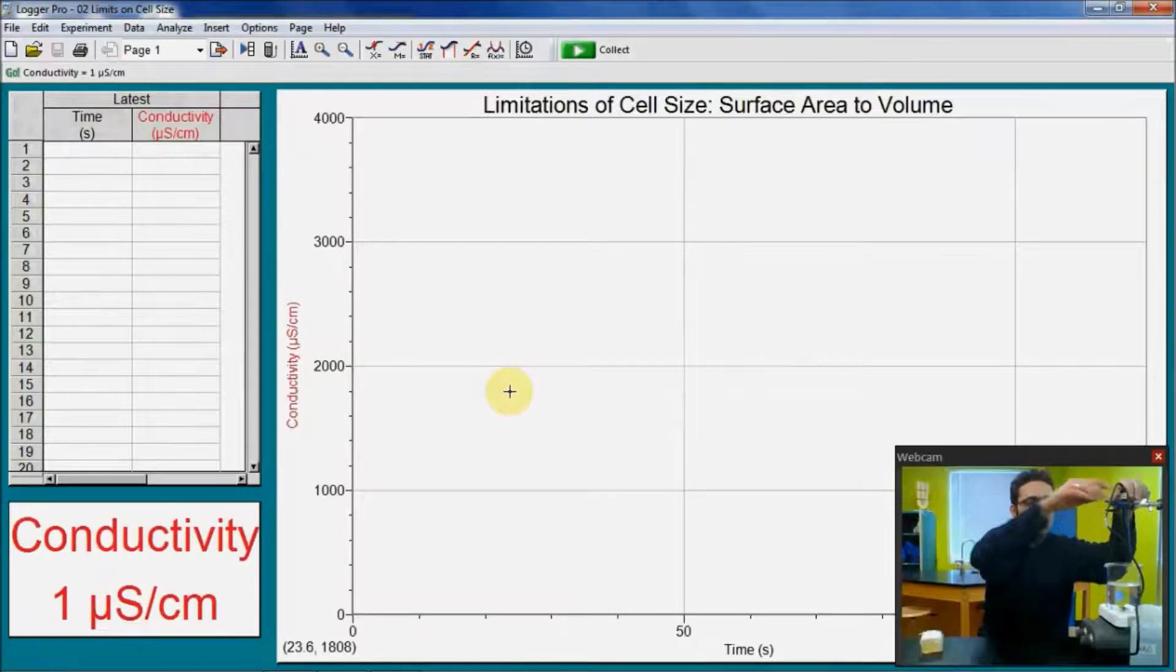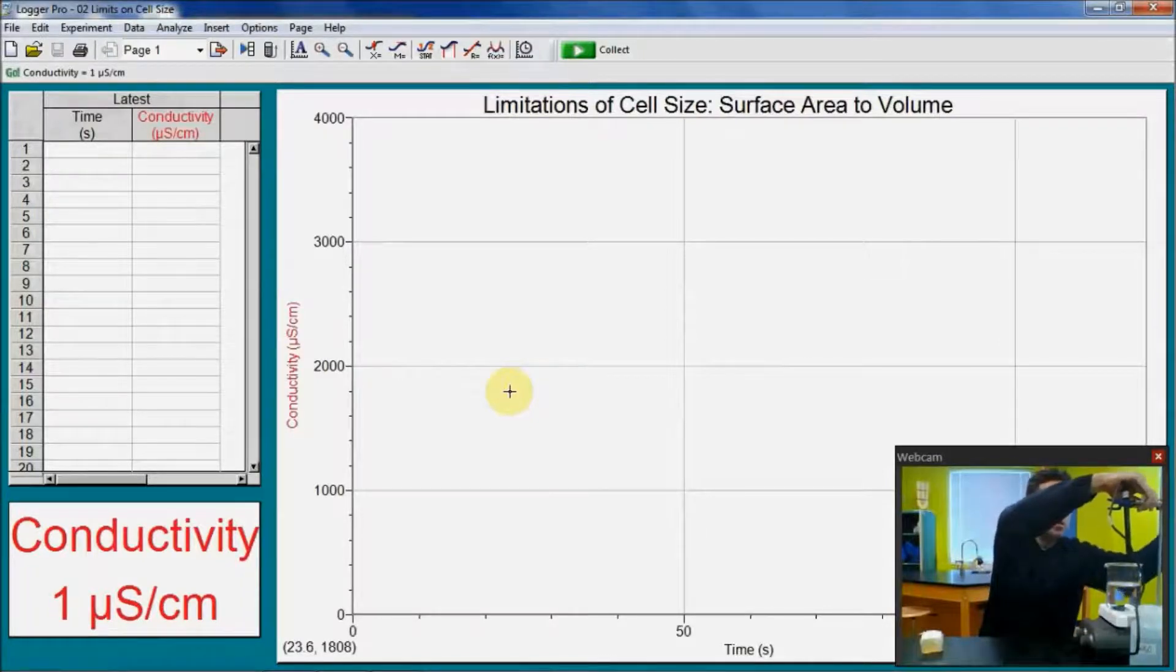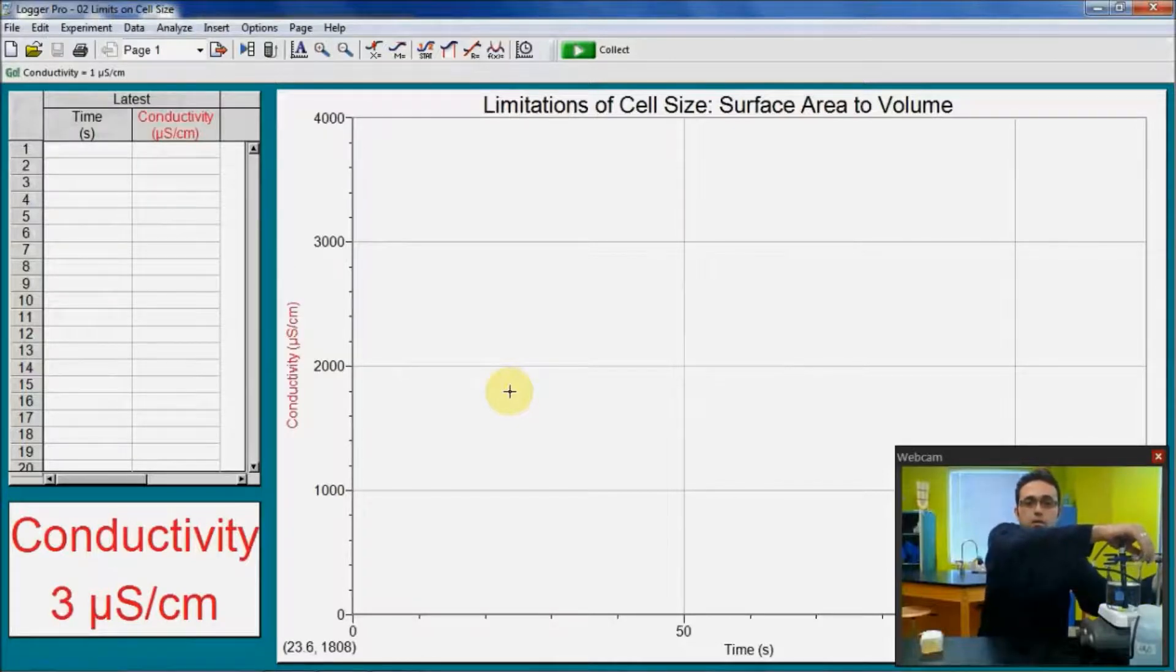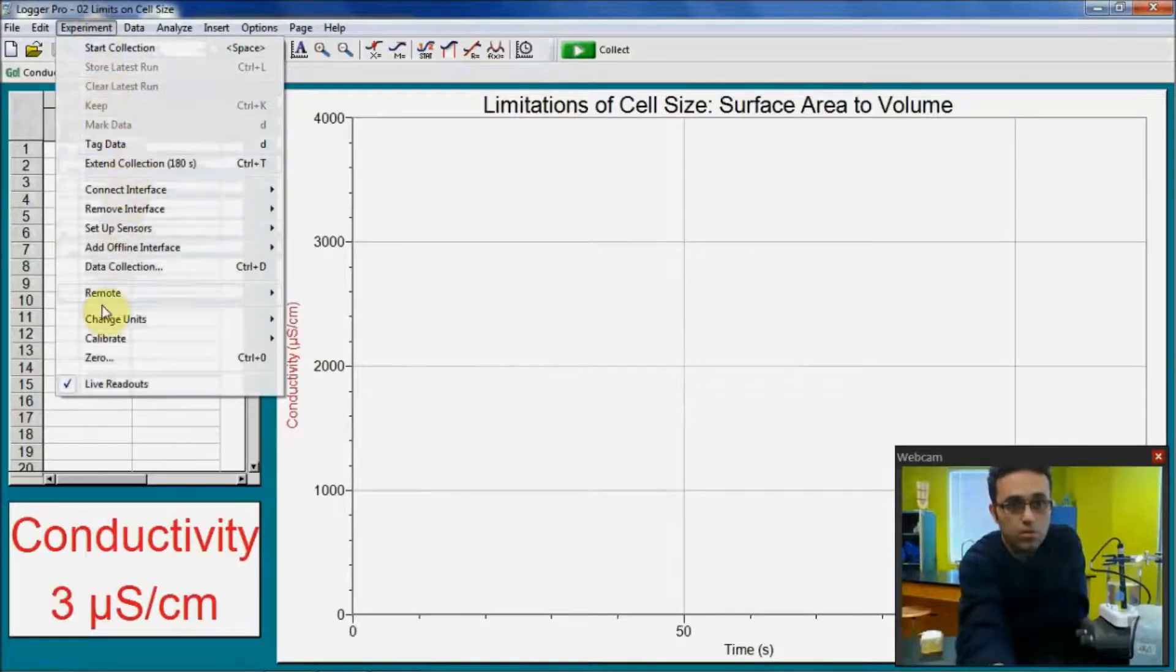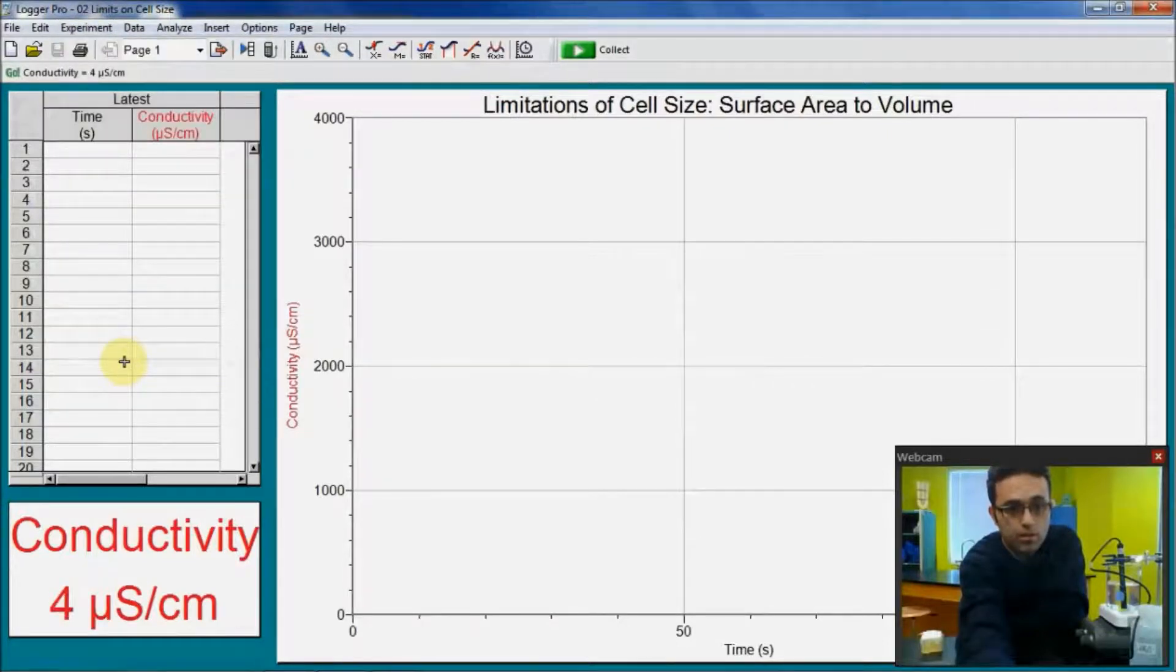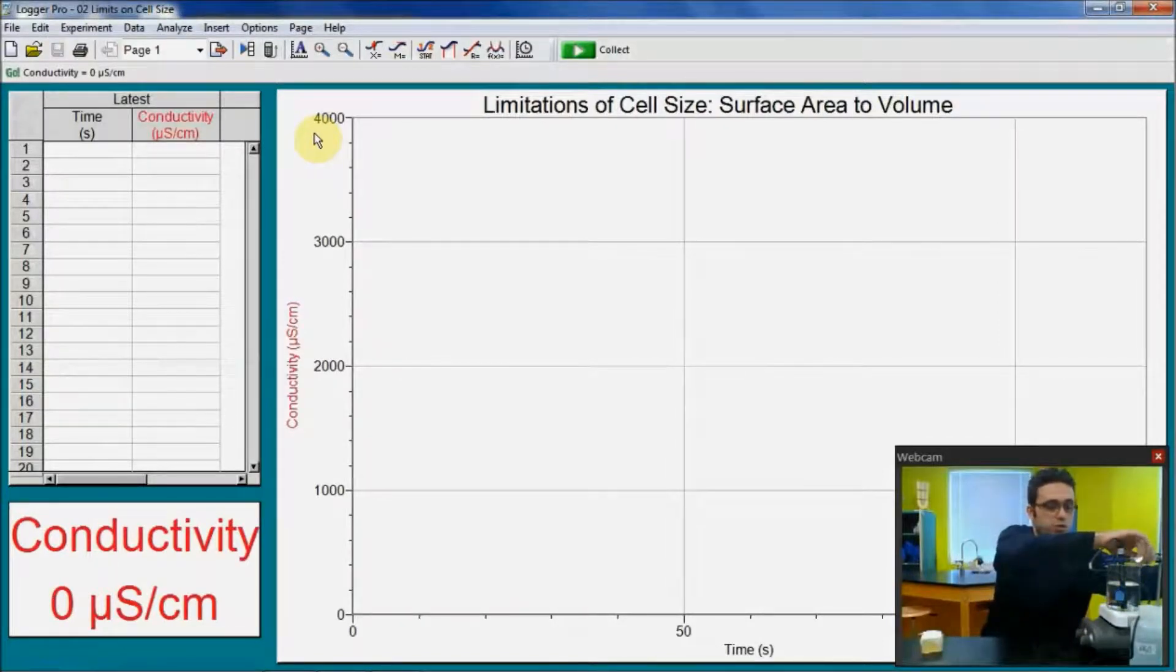They found it appropriate to select it from 0 to 20,000 while you're doing this experiment. Now I'm going to first calibrate my sensor to the distilled water because this distilled water might be kind of contaminated. It looks pretty nice though, but I will zero my sensor by clicking on this. How do you do it? Go to the experiment tab, click on it, go down, and click on zero. That's zero. It fluctuates, but the small fluctuations are fine.